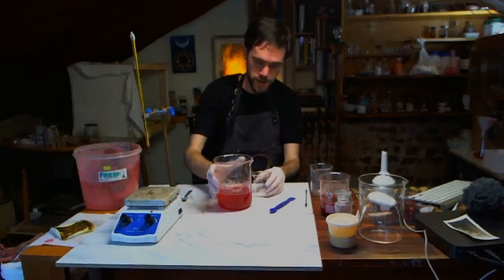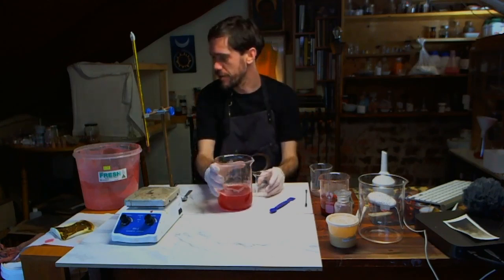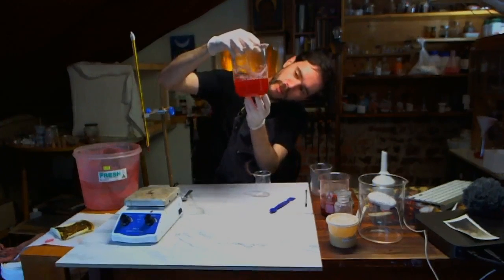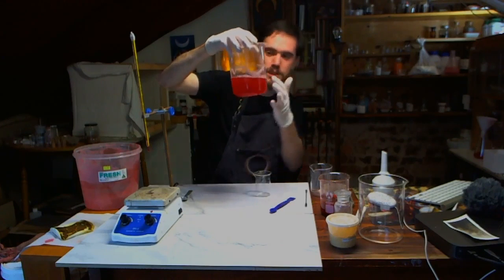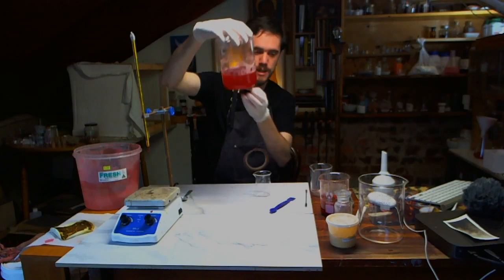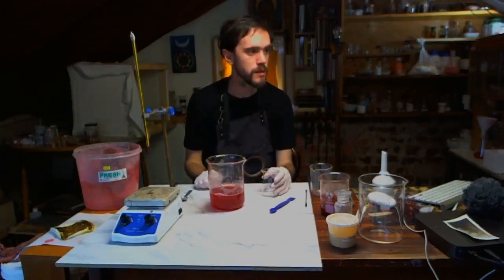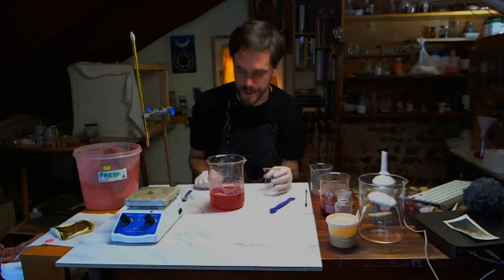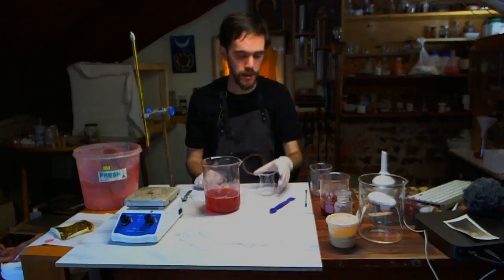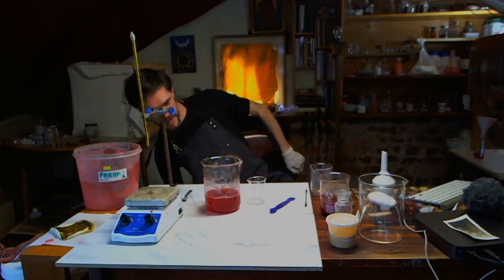So maybe we did get everything in the first run. And whatever was left in there was just so minuscule, it's enough to colour the liquid, but not enough to extract anything. We could mix up more soda and add it in. What do you think? You think we should add more soda and try and keep precipitating, or maybe it's just done for? Let's add more soda.